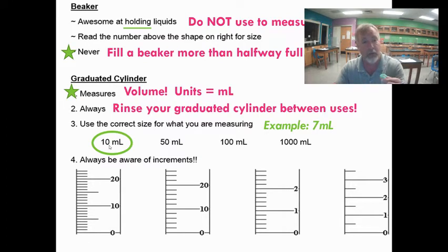Now, if we needed 13 milliliters, yeah, that's bigger than this 10 milliliter graduated cylinder can handle. So we just measure 10 the first time and 3 the second time. Much more accurate, much more precise, rather, if you use this guy to measure 13 milliliters than this guy. Both can do it, but let's use the instrument that's better suited, with more precision for what we're doing. Now, if we're talking 40 milliliters, you don't want to be filling this thing up 4 times. At this point, then you would use the bigger one. But use a little bit of common sense, okay?